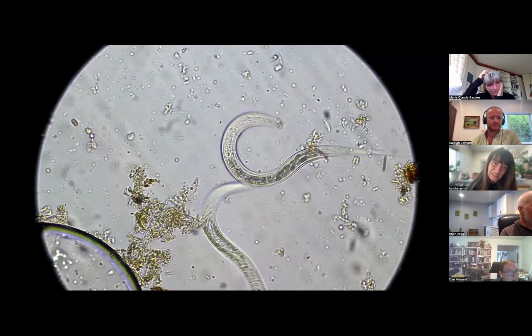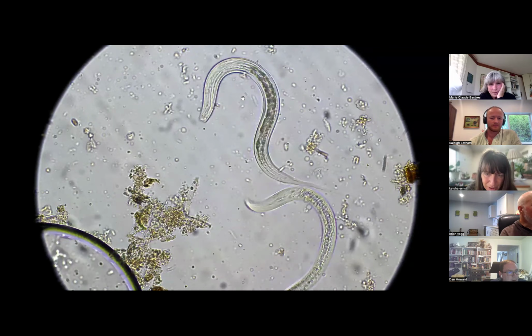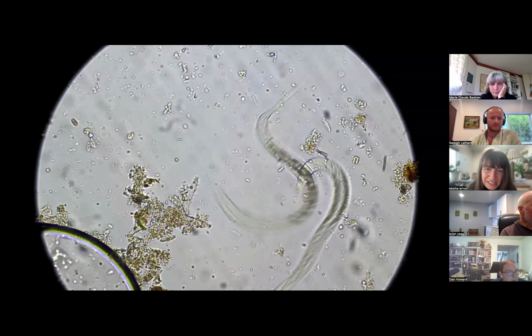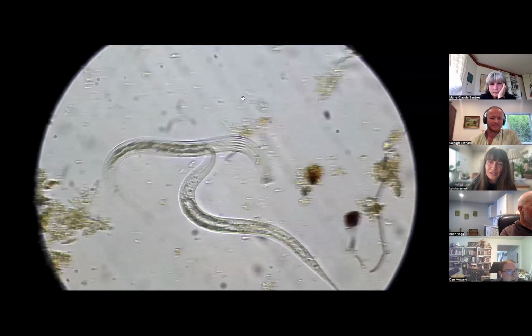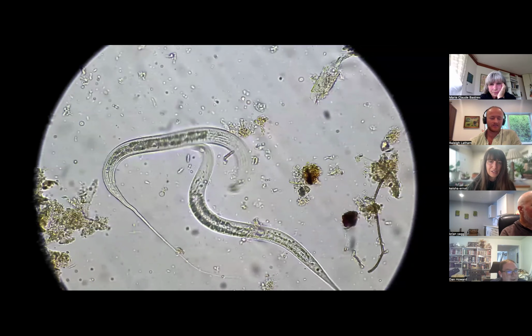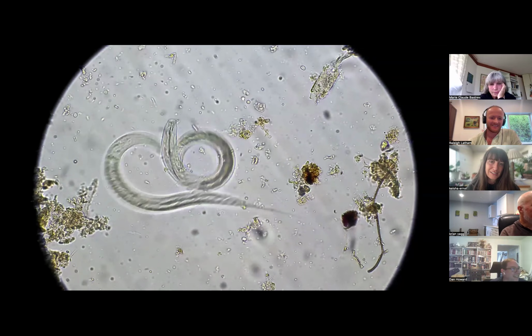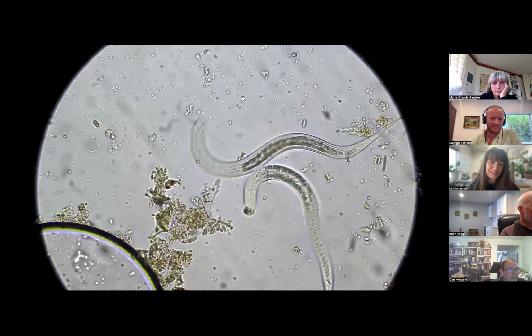And that's a fungal feeder, yeah? Or no? Maybe that's the other one, I think it's an actual omnivore. Look at the mouth. Okay, I see it now. They're moving so fast. If they start eating each other, that's going to be wild. A little battle of nematodes going on here. I know, that's crazy. It's wild.